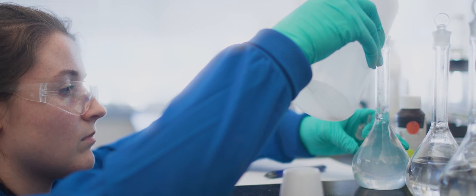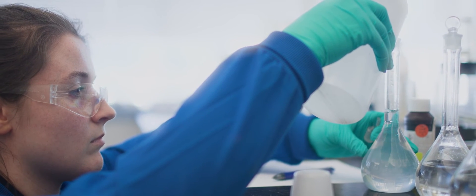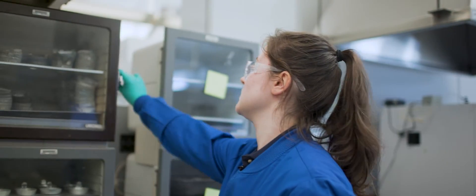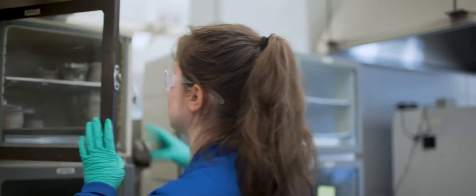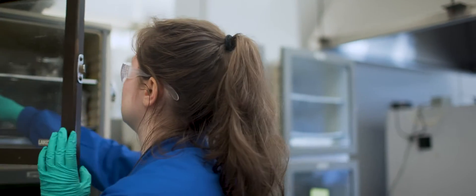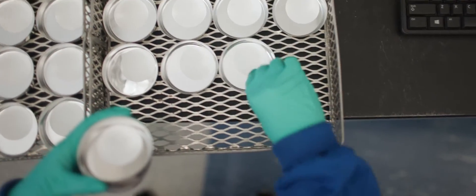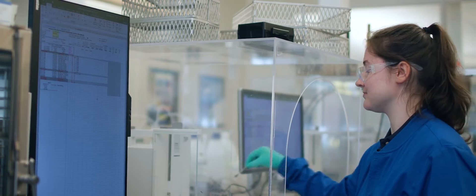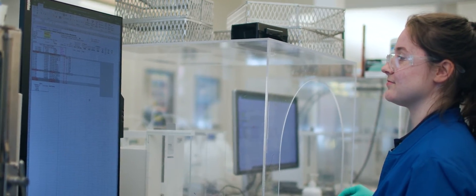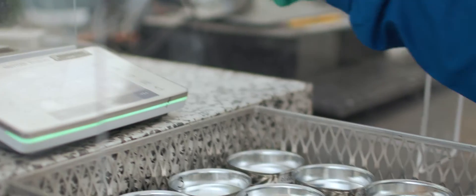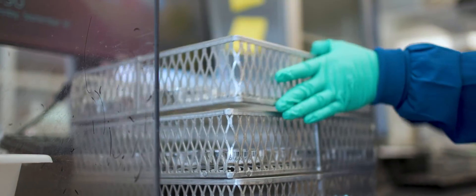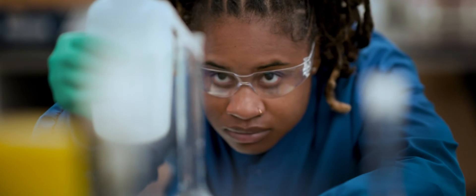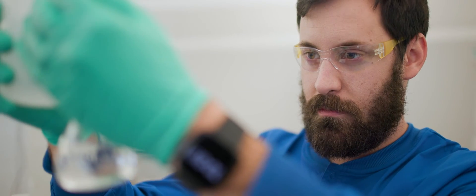With focus and precision, Kimberly conducts a variety of tests. This process gets muffled to get the volatile aspect of the suspended solids. I kind of see it as maybe not equivalent to the medical field, but something up there where you feel a bit heroic in a small way. There's a large impact that we have because we're protecting nearly 2 million customers.